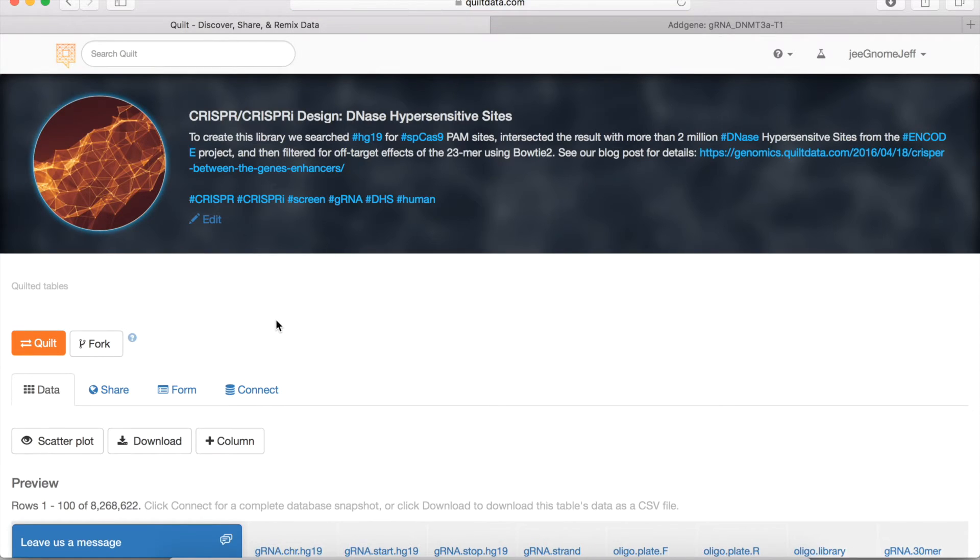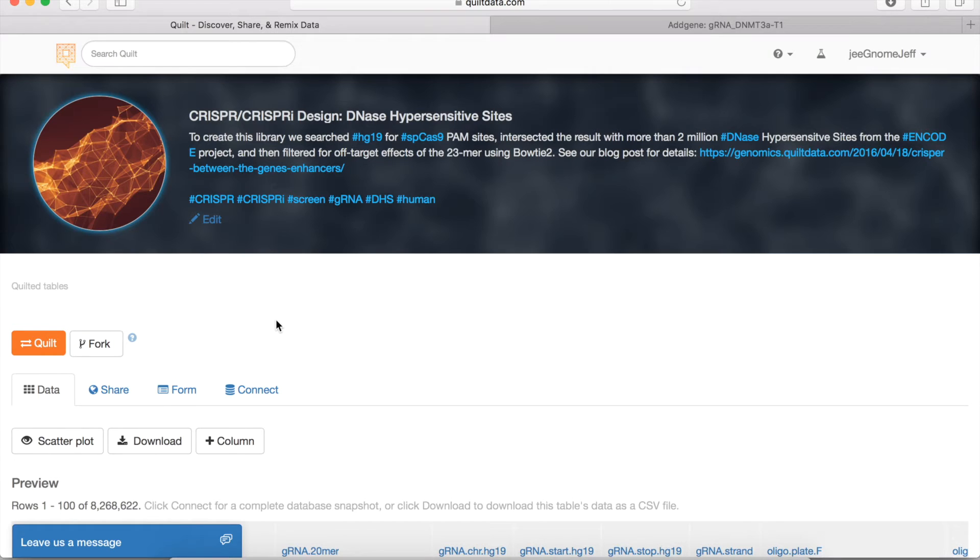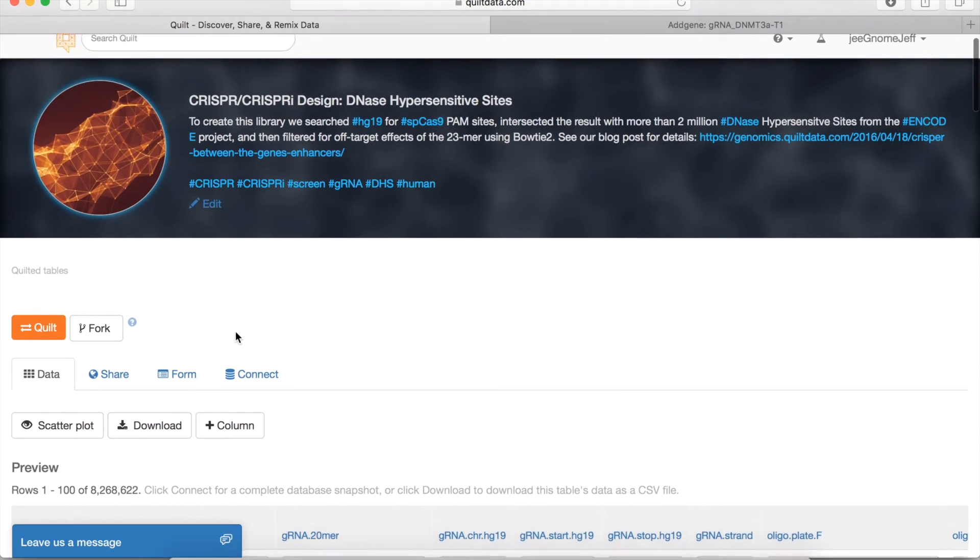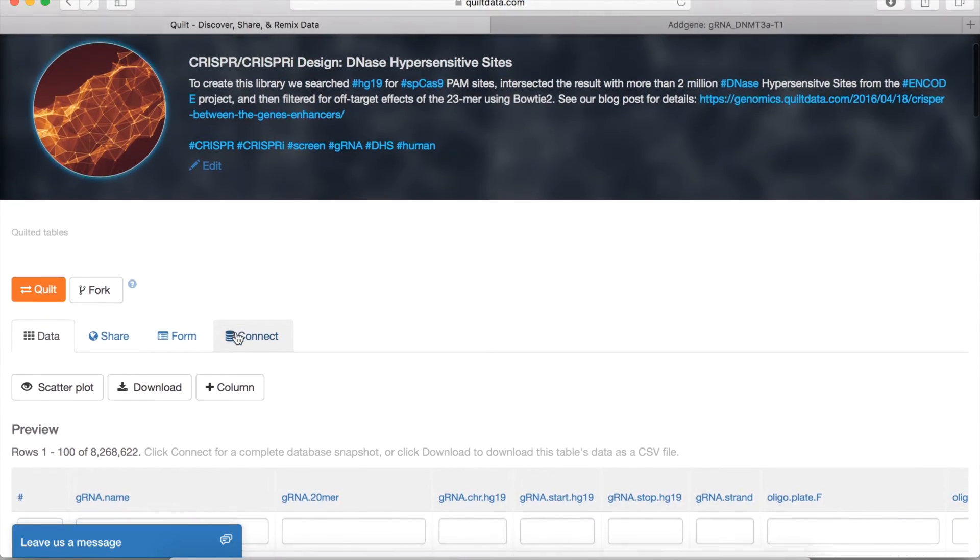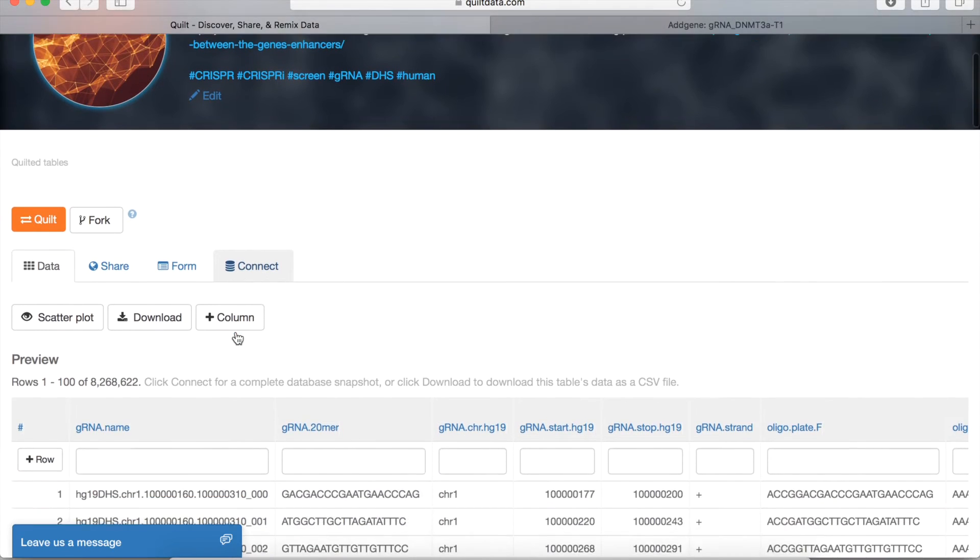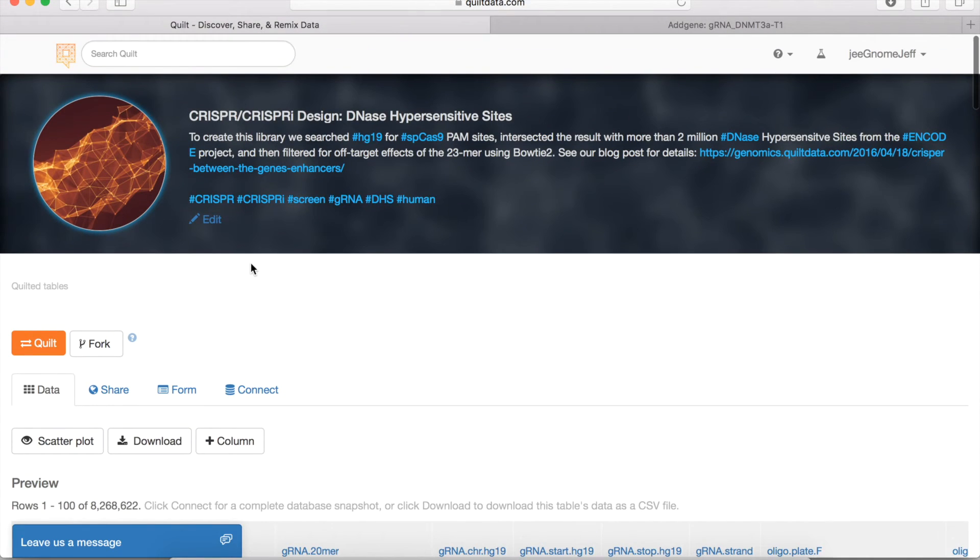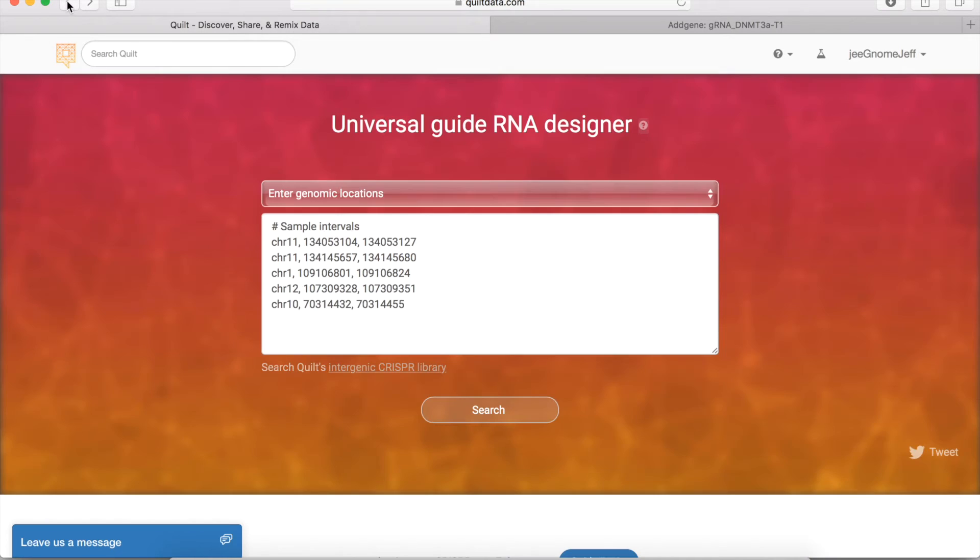is to look for all of the DNase hypersensitive sites in the human genome, according to the ENCODE project, in the HG19 build, and design guide RNAs to those regions and filter for off-target effects. So you can get access to that clicking here.